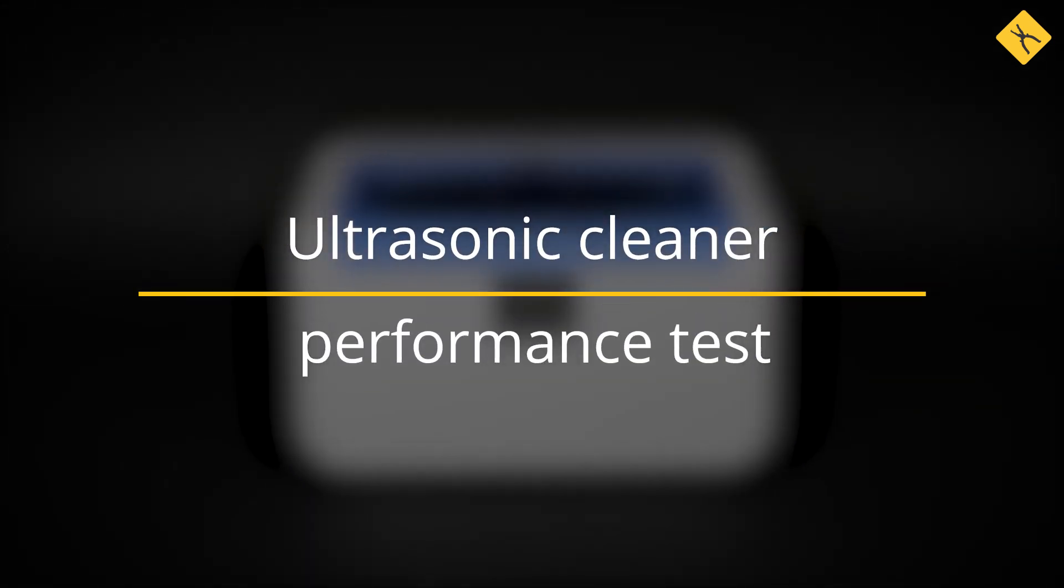Hi everyone! Today we will show you how to test the performance of the ultrasonic cleaning device.